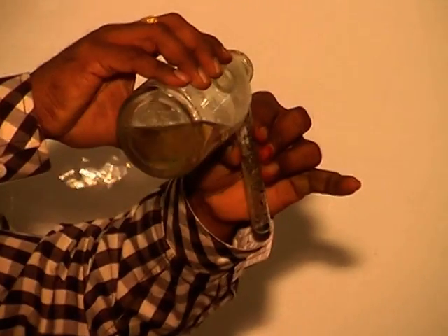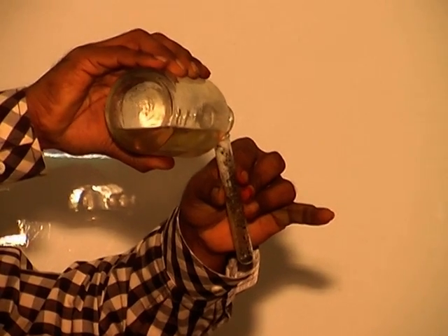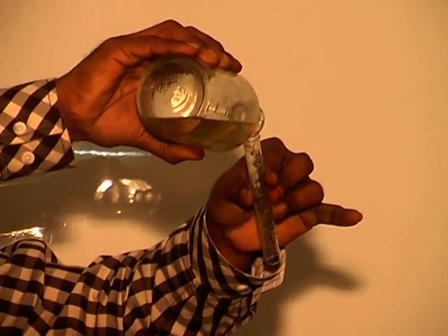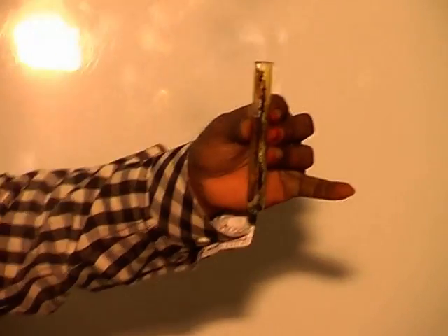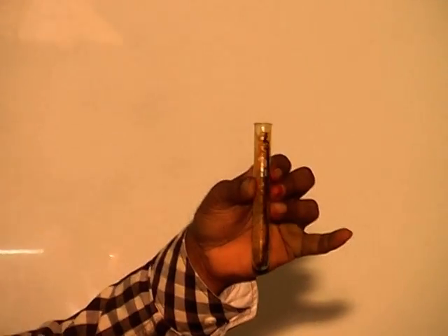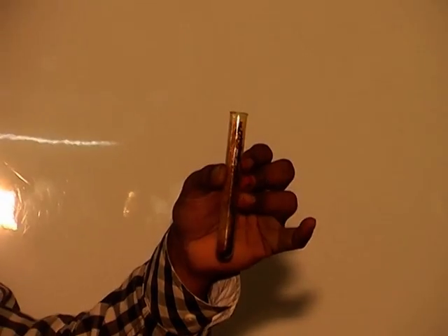Then I am adding concentrated sulfuric acid. Reddish brown vapors are evolved, then bromide may be present.